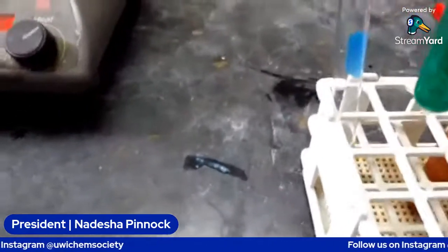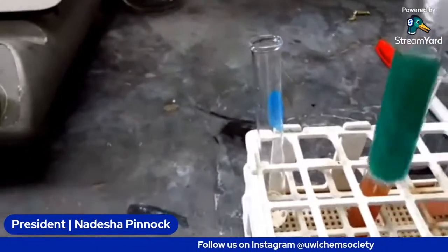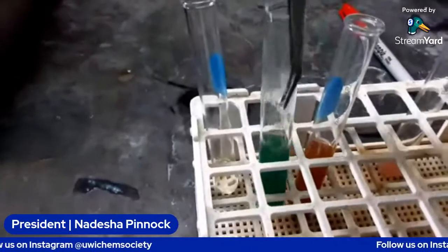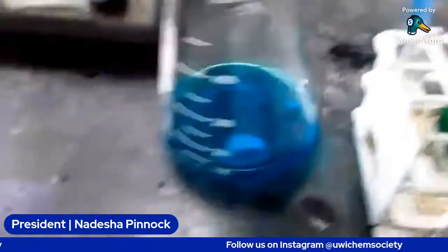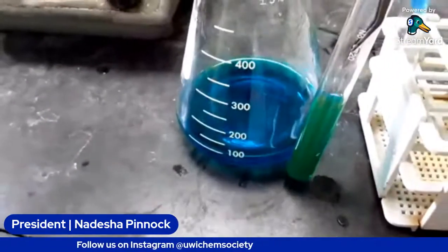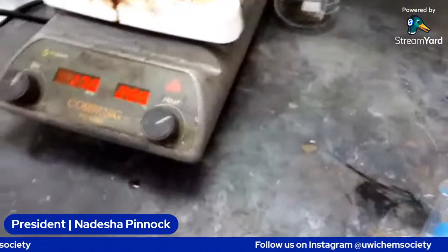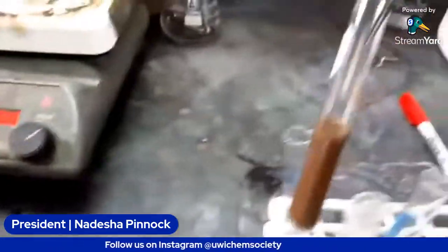So it's probably a traceable amount of sugar in it, because it's blue-green in color. It's not blue, because if I compare it to the Benedict's, which is really bright blue, this is kind of green. Yeah. Next one. Let's see.